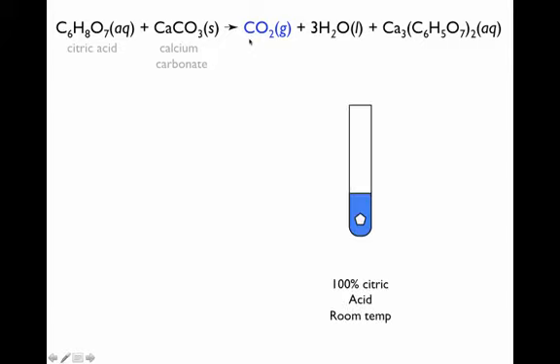And so here's the first test tube. This is the first chemical reaction. Basically, this blue liquid here is supposed to be the citric acid. That's my cartoon version of the citric acid. And you're going to drop in a small rock of calcium carbonate.